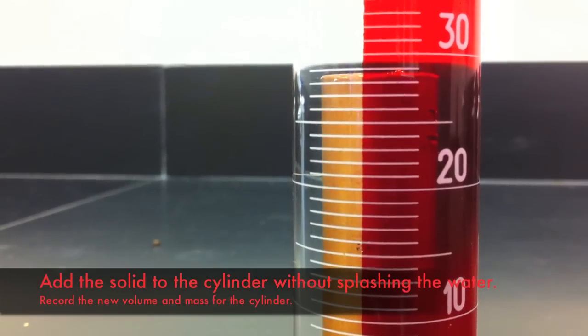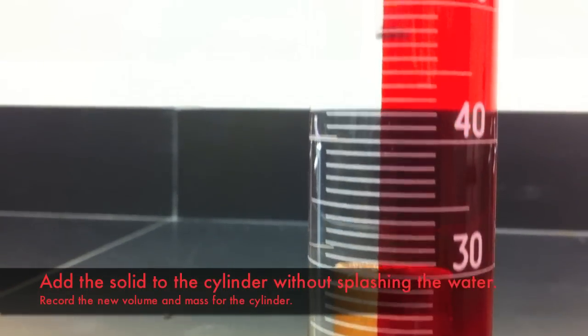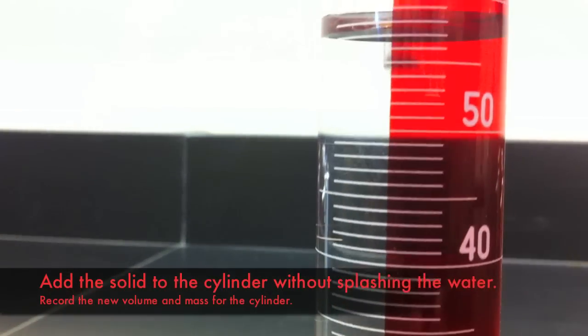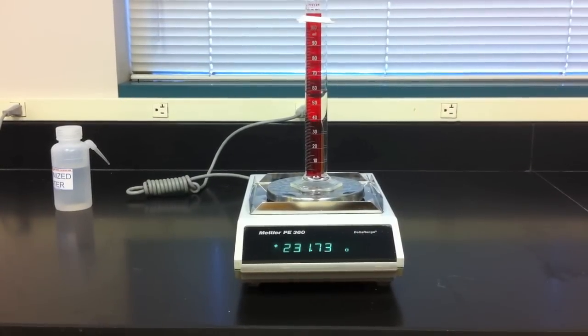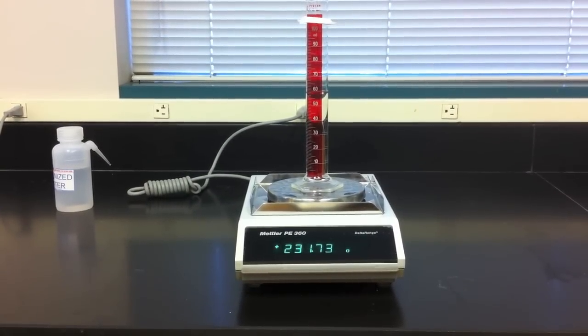With the solid in the graduated cylinder, remeasure the volume of liquid in the cylinder. The difference between this reading and the original reading is the volume of the solid. The difference in mass of the cylinder from the original weight is obviously the weight of the solid.